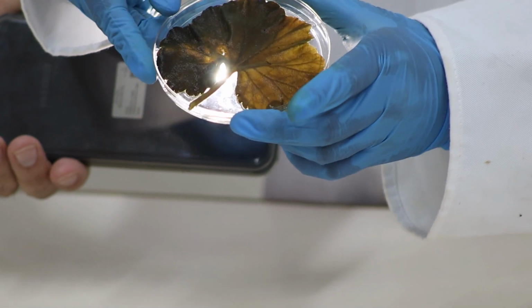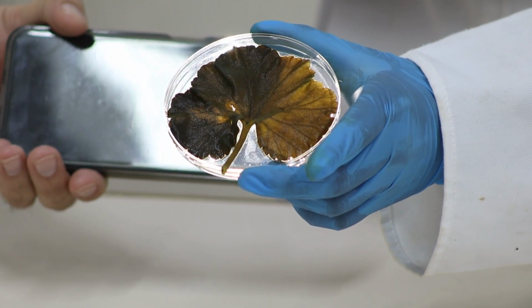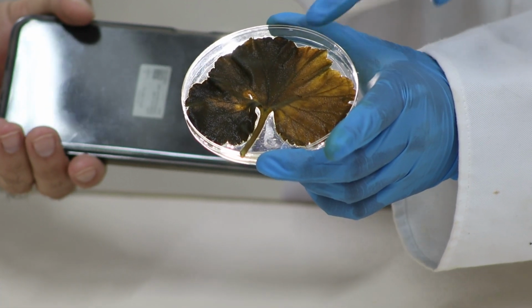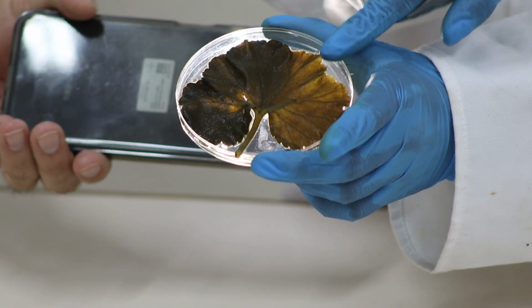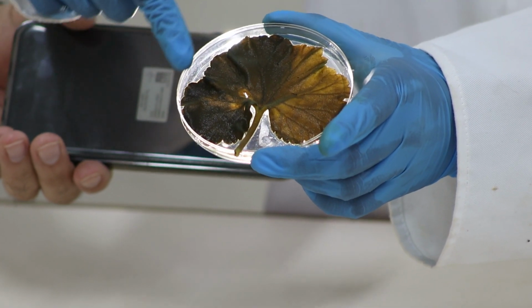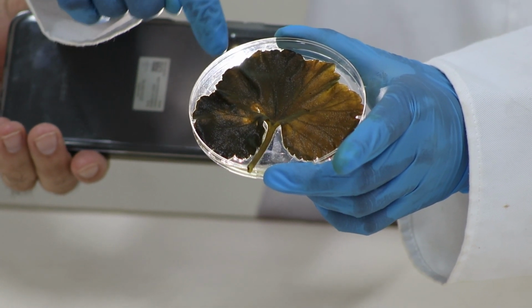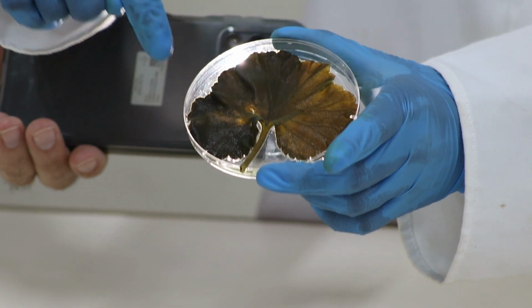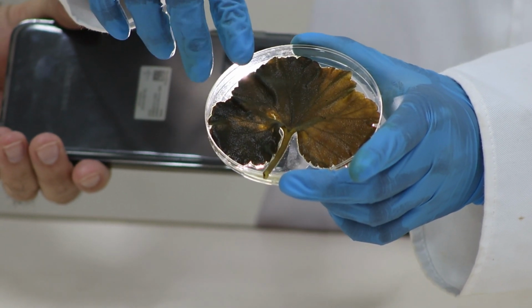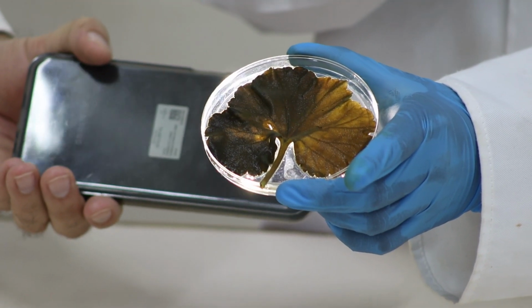to light. As we can see, half of the leaf remained a rusty orange color after iodine was added, and so we can conclude that no photosynthesis was occurring on this half of the leaf. On this half of the leaf that was exposed to light, the iodine has actually changed to a bluish black color, which indicates the presence of starch and therefore the presence of photosynthesis. So photosynthesis did occur on this half of the leaf.